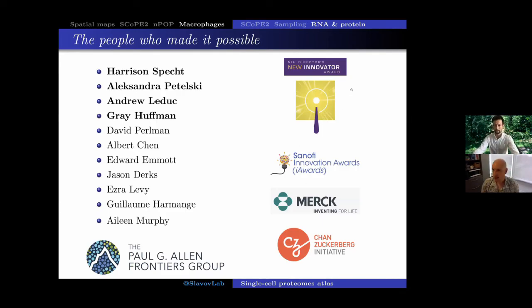Thank you for that wonderful talk, and we got a couple of questions in the chat. First off, this is from Sesway Chen: could you comment on the booster channel contamination issue with MS2, and should we be using MS3 for quantification?